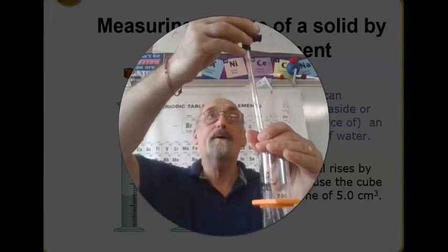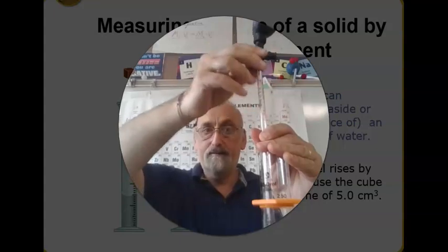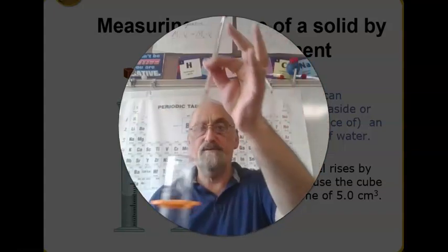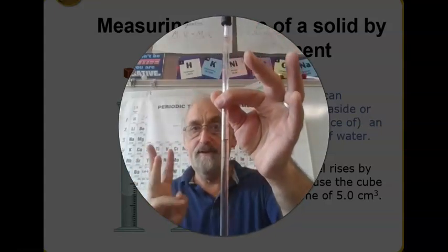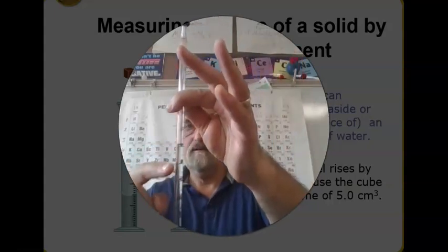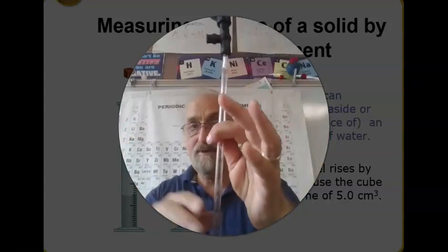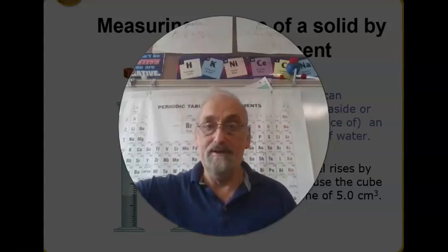So reading from a pipette can be done the same way. I put the pipette in and I read the level. Let's say I bring this up to the bottom of the meniscus, reads 7.00, and I want to deliver 3 milliliters. I would go from 7 to 6 to 5 to 4, and that would give me exactly 3 milliliters added. So we read from the bottom of the meniscus in any piece of glassware that we're working with.